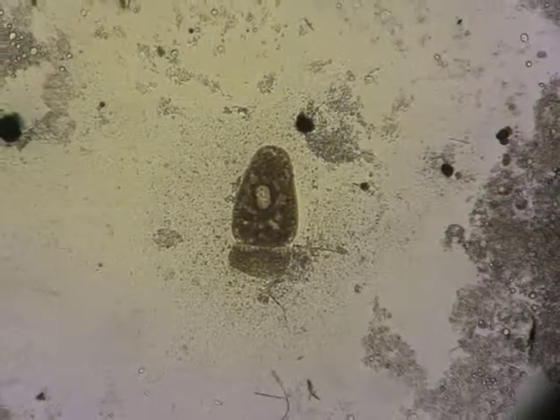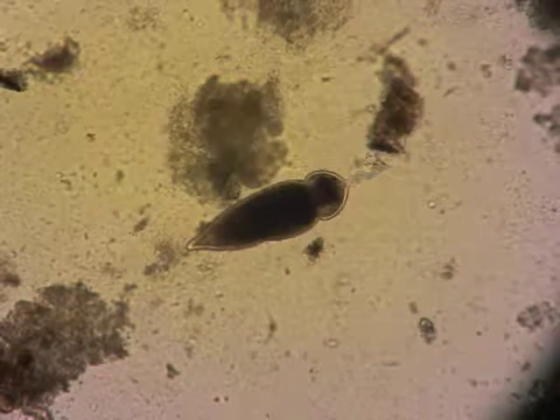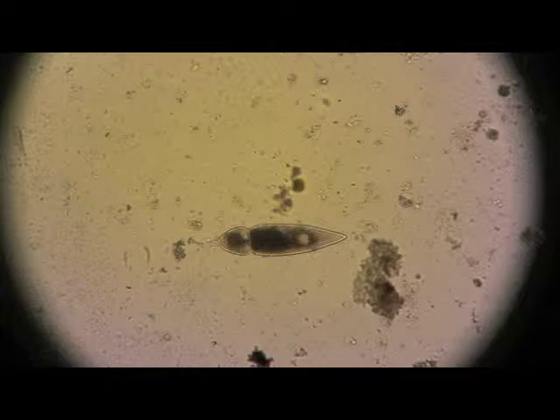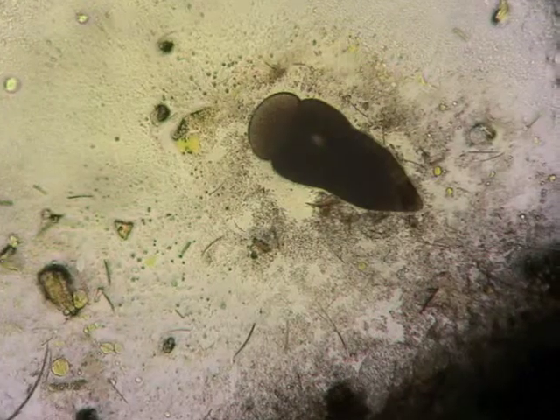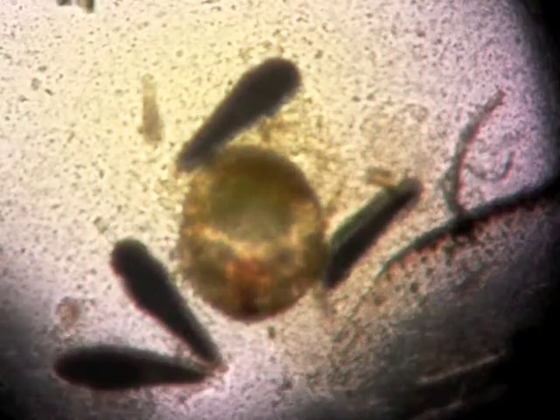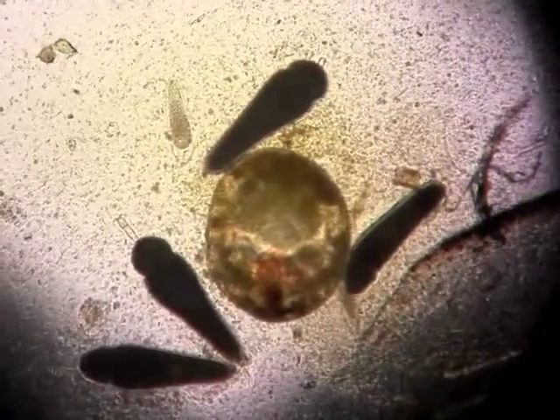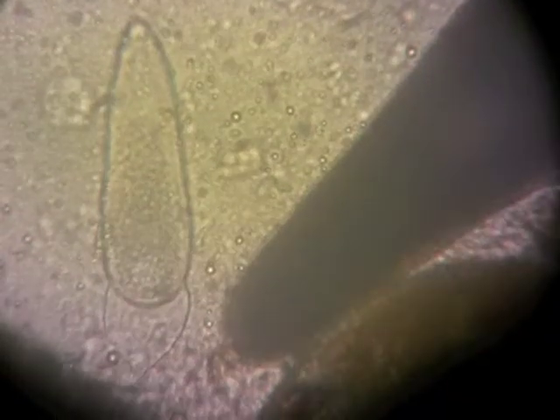Under the compound scope, they will look like this. We have multiple species here. You'll notice three separate parts: a deutomerite at the posterior end on the right of this specimen, a protomerite which is a small piece of that snowman-looking structure, and then on the left is the epimerite. We need all three of those in order to identify these specimens. They each have their own unique shape and size, and we should expect to see somewhere between three and four species of gregarines in these hosts.